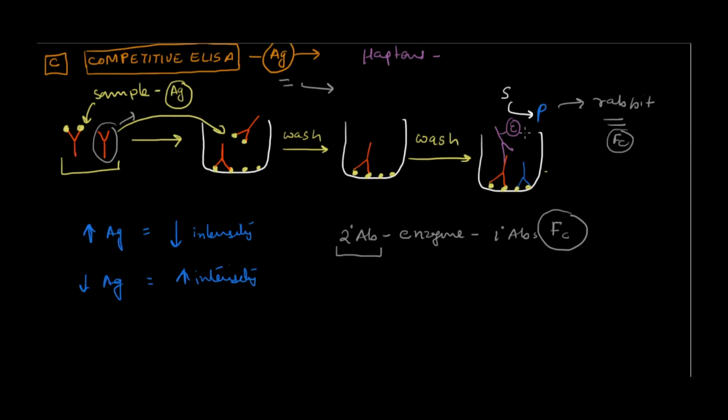So if I have one set of secondary antibodies conjugated with enzyme, with different types of assays that I'm performing for detection of different types of antigen, I can go ahead and do multiple detections with this secondary antibody itself, right? So that becomes much more cost effective to design the assay. So that's why we use secondary antibodies. It is not always that you have to use it. You can always go ahead and label your primary antibody also. You might read about this competitive direct ELISA, where the primary antibody is directly labeled.